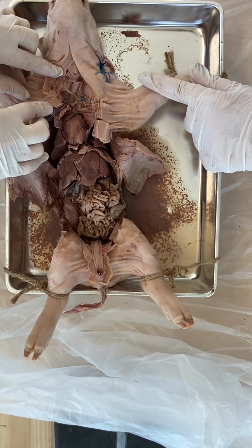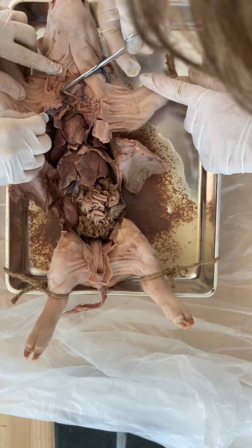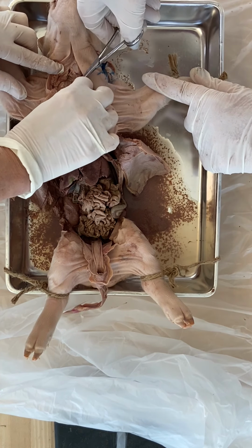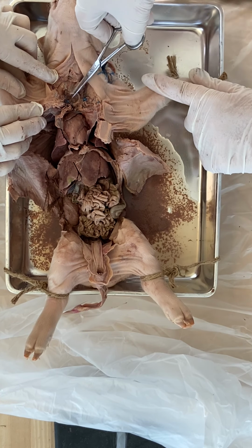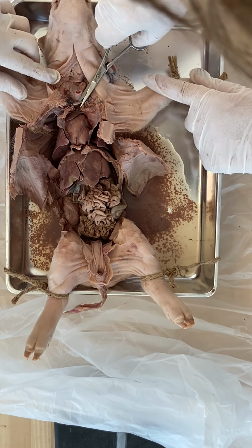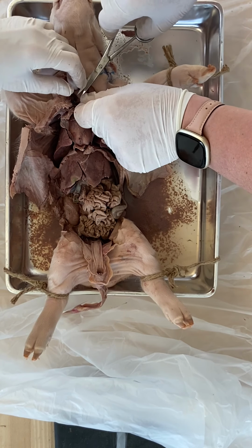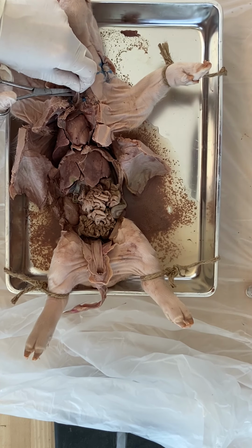Cut it up here so we can have it closer. So if you look at that, that's definitely a blood vessel. And we can see blue dye in there. Can you? Oh, red dye in there, so that is an artery, or pulmonary vein. All pulmonary vein. And because of its size, I bet that's what it is.